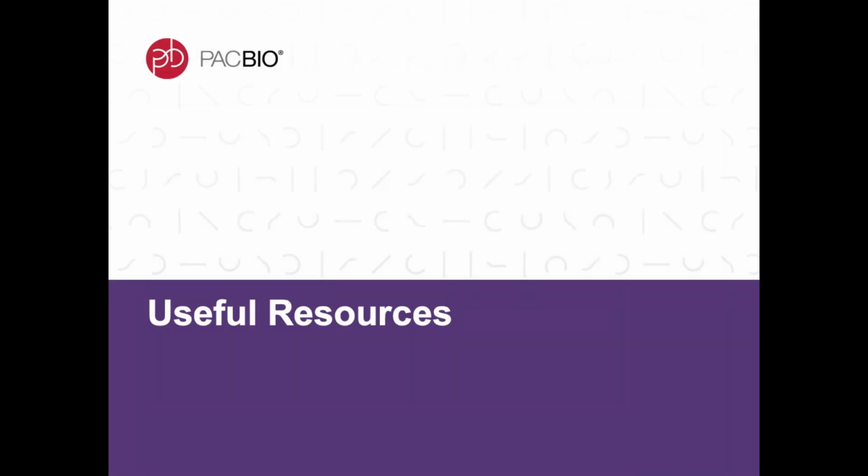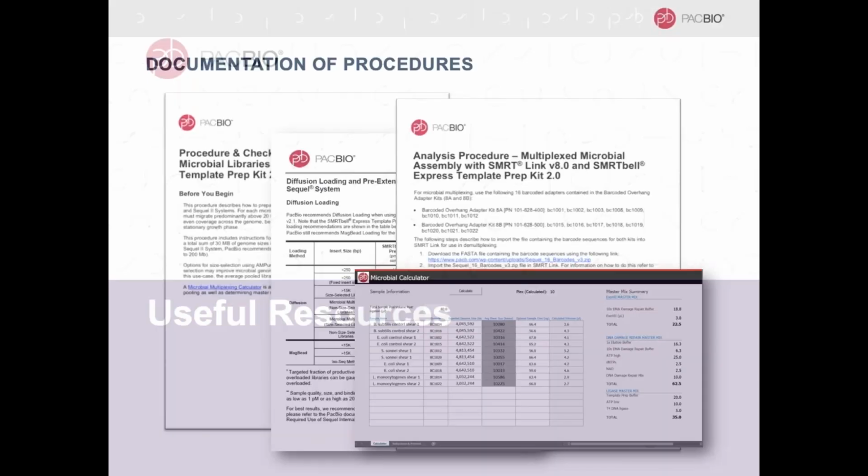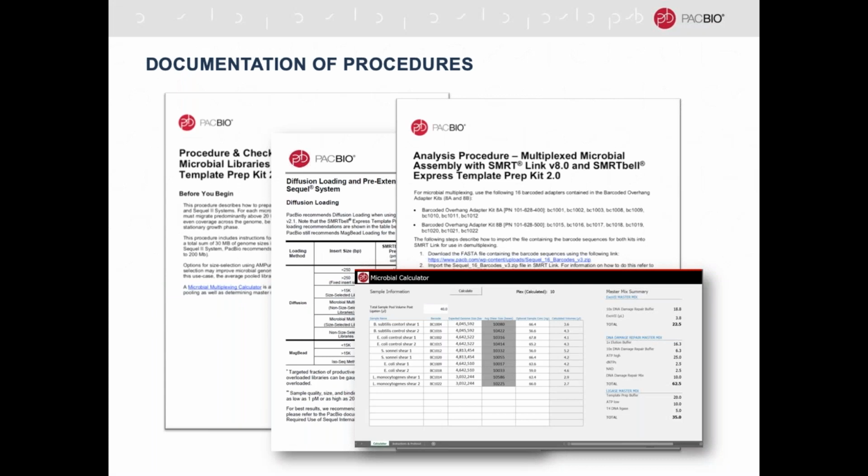So that is just about it. We'll wrap it up here with useful resources and then address any questions that came up during the presentation. I just wanted to point you to the documentation of procedures for all of these things on our website. You can see we have a few different pieces of documentation, again, all available through our website. So if you're interested in reading more about the library preparation or loading the instrument, anything with respect to the workflow, you can find that in these documents on our website.